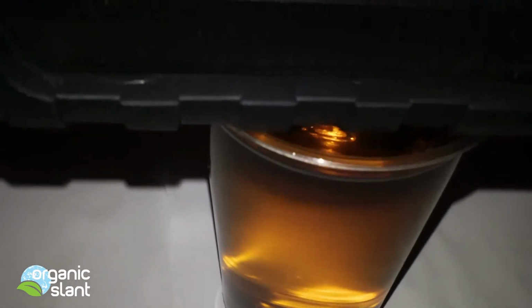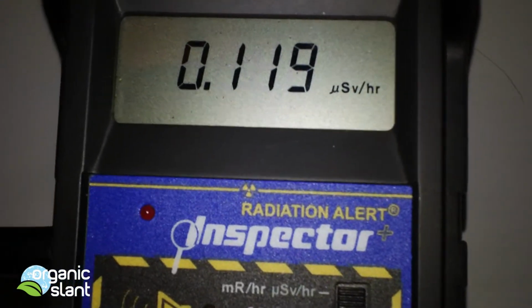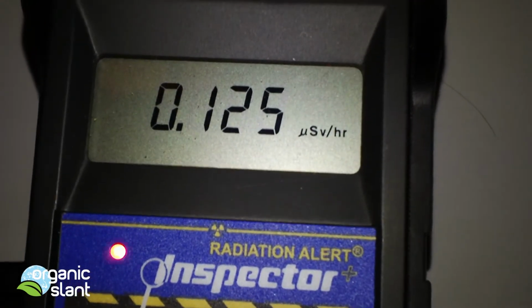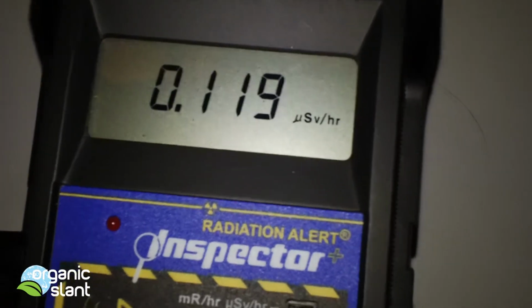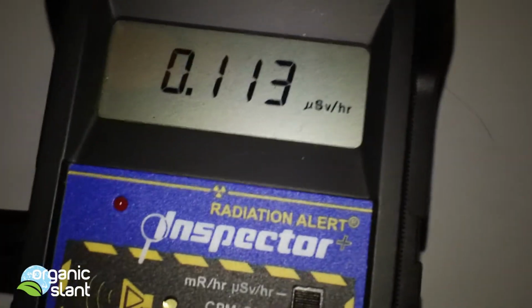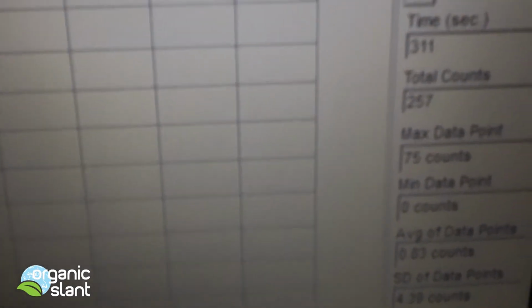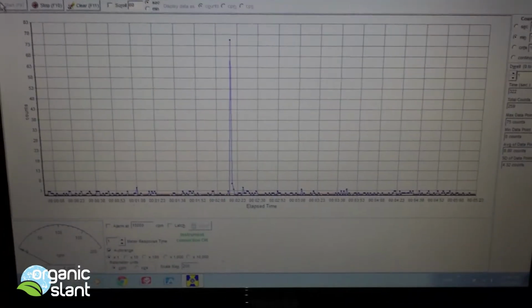So that means obviously the stuff went through, so I need to get a real sieve. I think the Japanese government does a .40 number, or a number 40, whatever .40 is. I'll have to look that up. But this is quite a surprise for me. So it's very early. We're only 300 seconds into it, and there's going to be 6,000 seconds, so I'm curious if it's going to pick something else up.